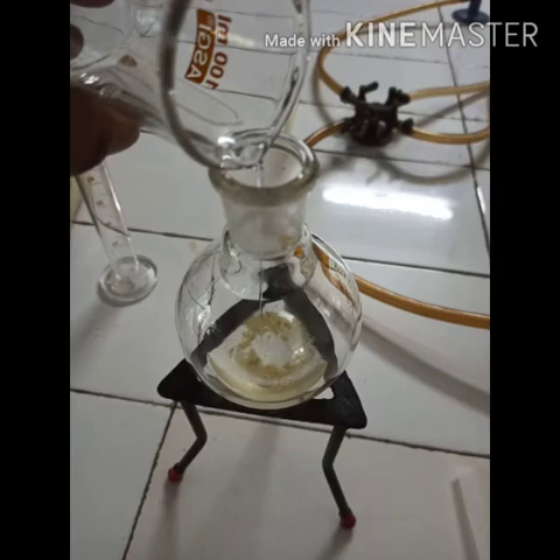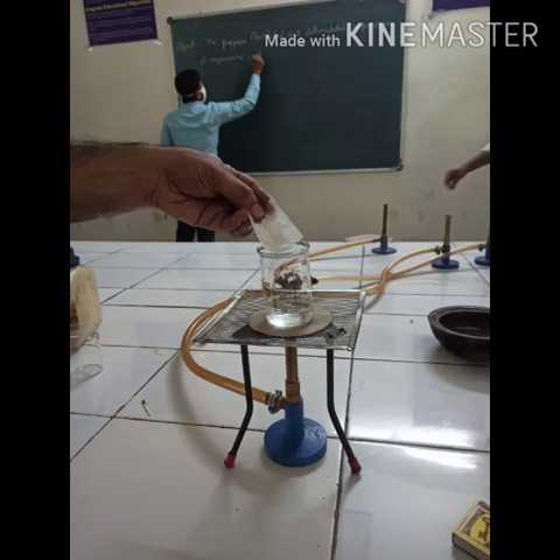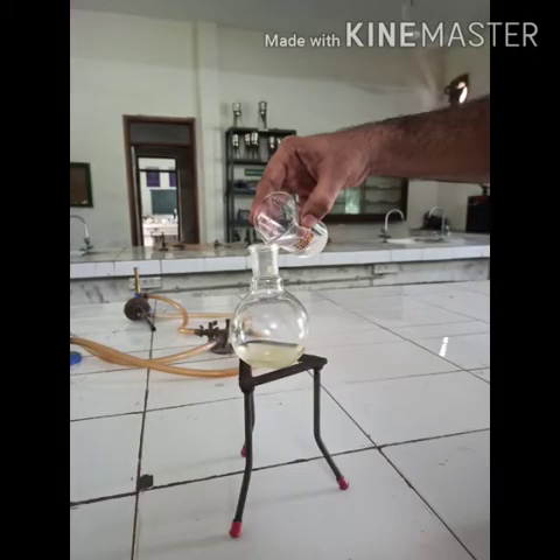3 grams of urea was accurately weighed with the help of a digital balance. It was then added to hot ethanol, and a solution of urea was prepared in hot ethanol. This hot solution of urea was then added to the round-bottom flask with constant stirring.